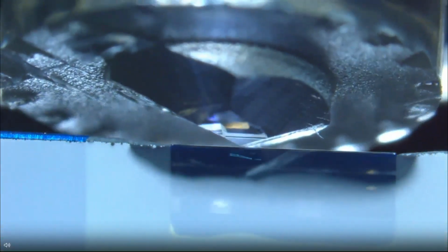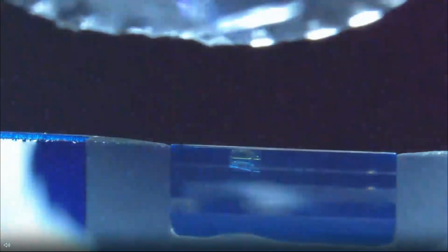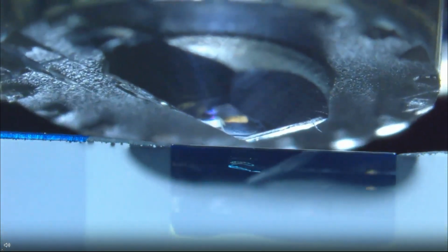And of course, we wanted to look quickly if we can see the fluorescence in the sections. We did some semi-thin sections here and switched to fluorescence to see if we can visualize the fluorescence also in the sections. And this was perfectly possible. You can see here the pharynx in the slices, in the sections.